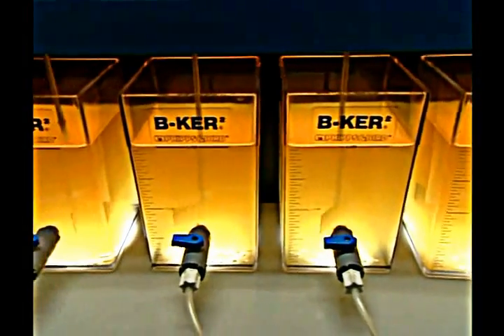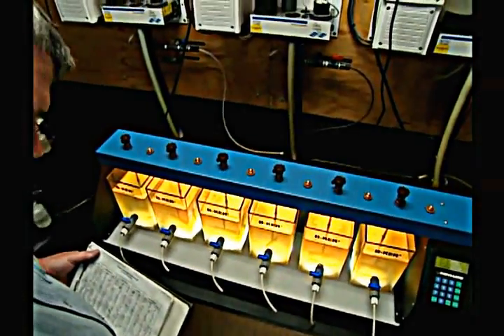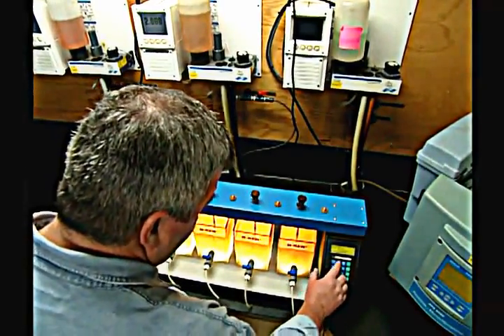Proper basin lighting allows operators to view floc development at critical stages of formation. And finally, jar testing has proven to be very effective. Jar tests are a good way for the operator to examine the chemical dose as well as mixing times and speed. A jar test can simulate the full-scale plant's mixing and settling in a laboratory setting with many possible adjustments under consideration.